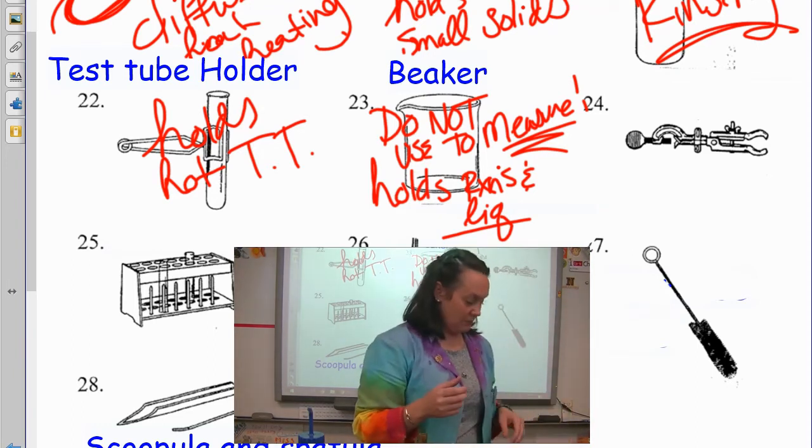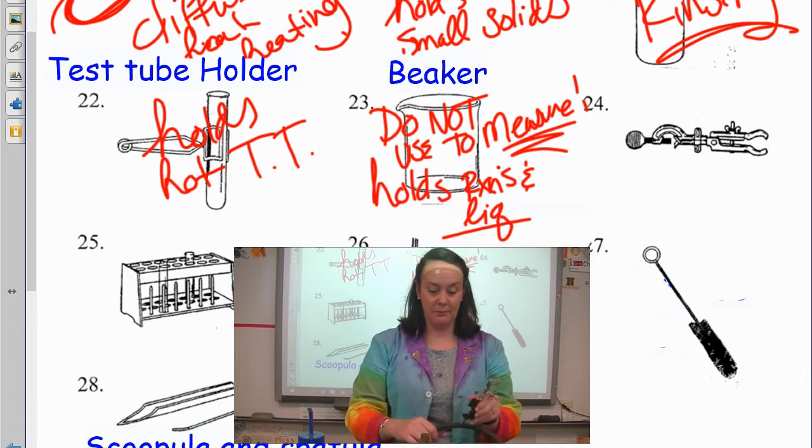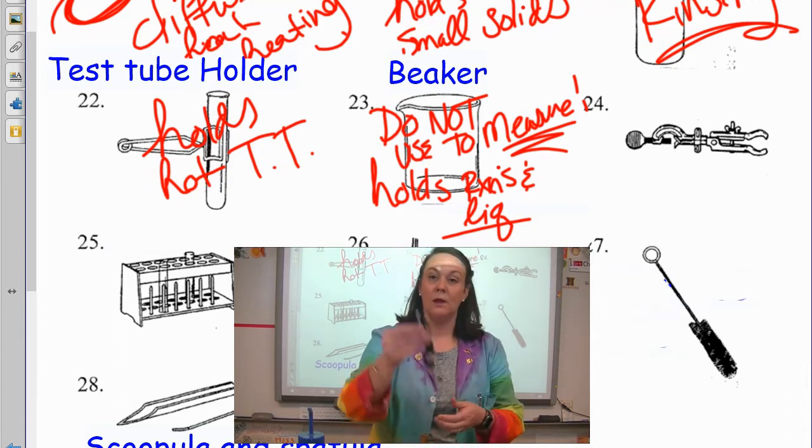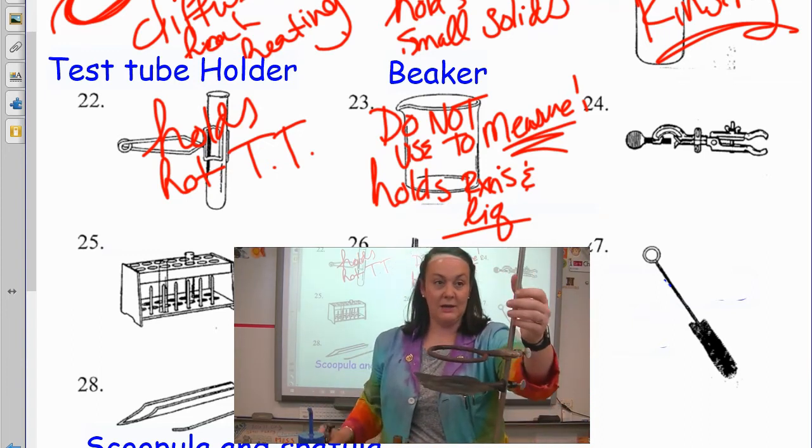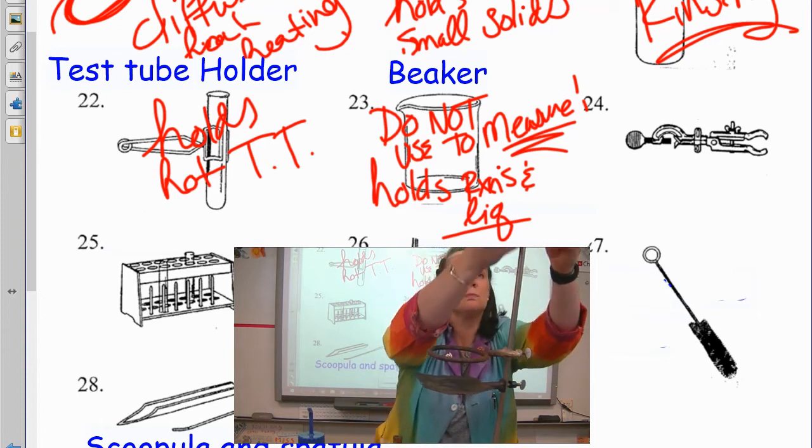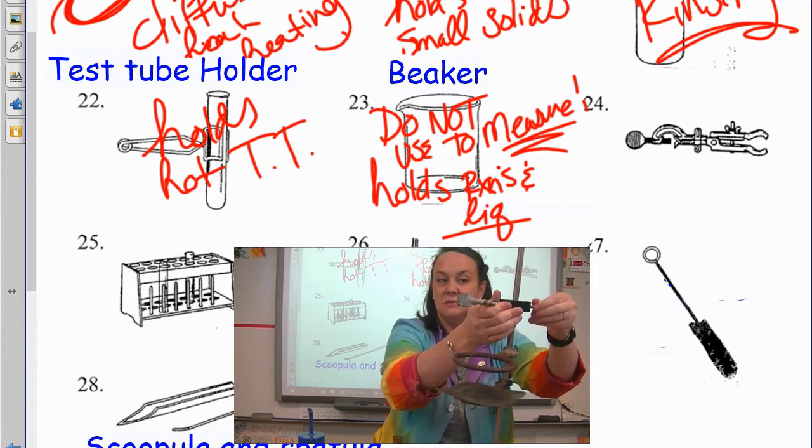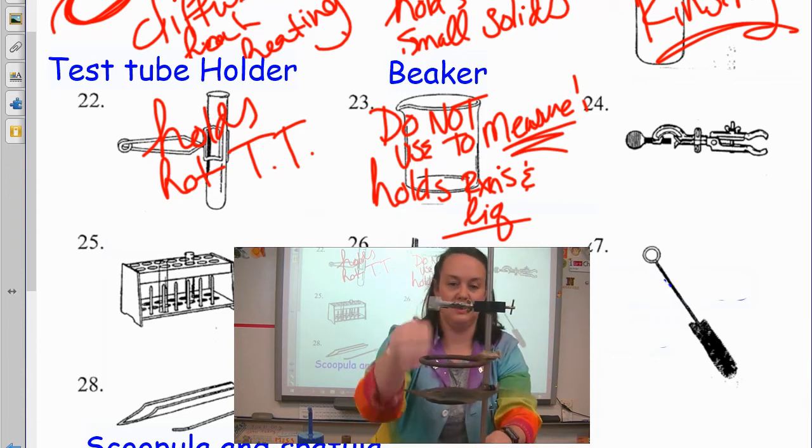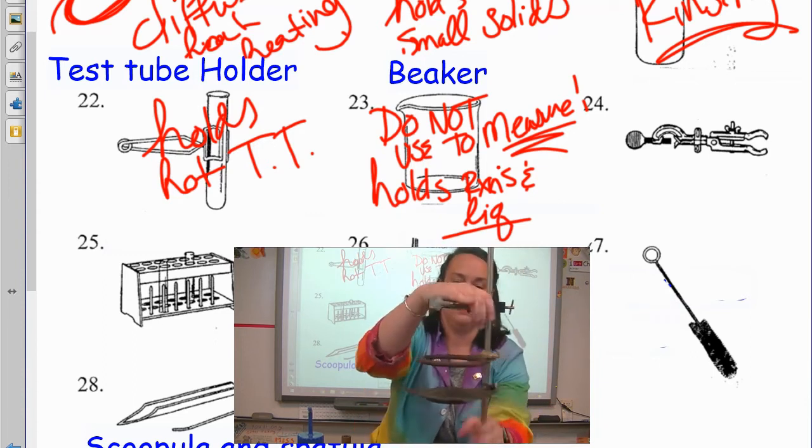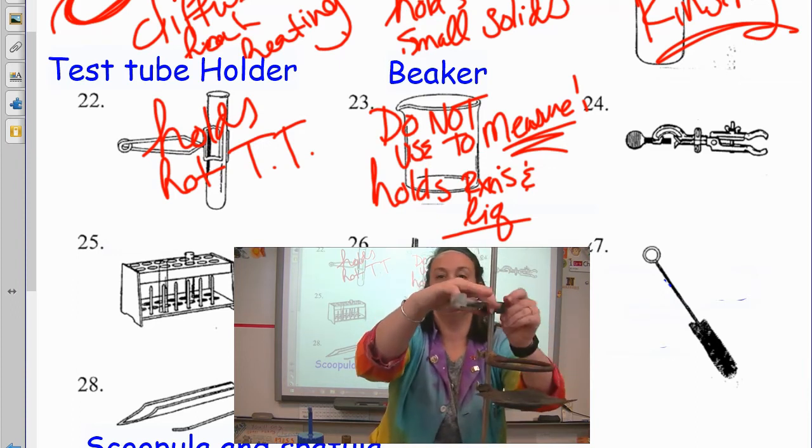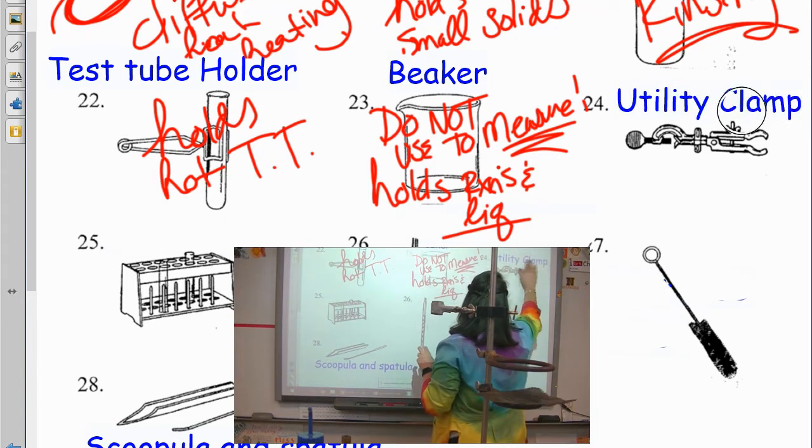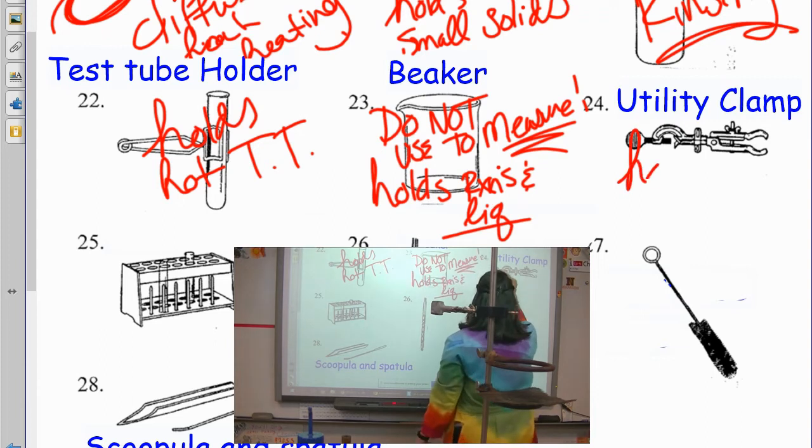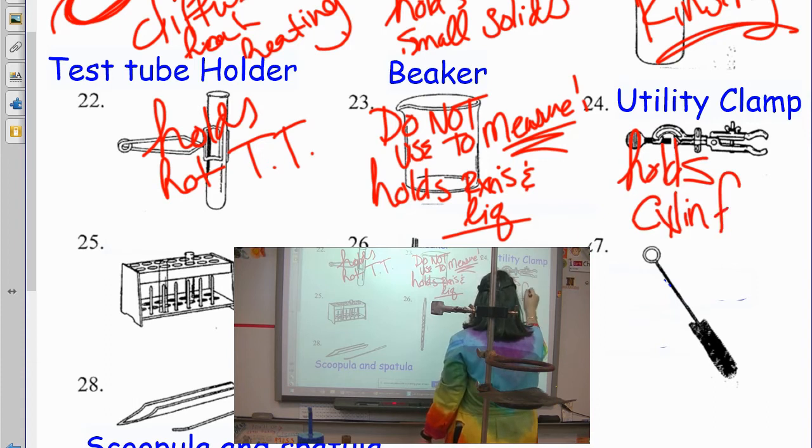The next one is where I'm getting the clamp board mixed up. This is called a utility clamp. A utility clamp. And what a utility clamp can do is it can clamp onto the standard apparatus. And it can hold anything cylindrical. So it can hold round things. Here, I'll turn this away. And make this go forward. So what you can do, so we'll say, utility clamps, excuse me, holds cylinders for heating.